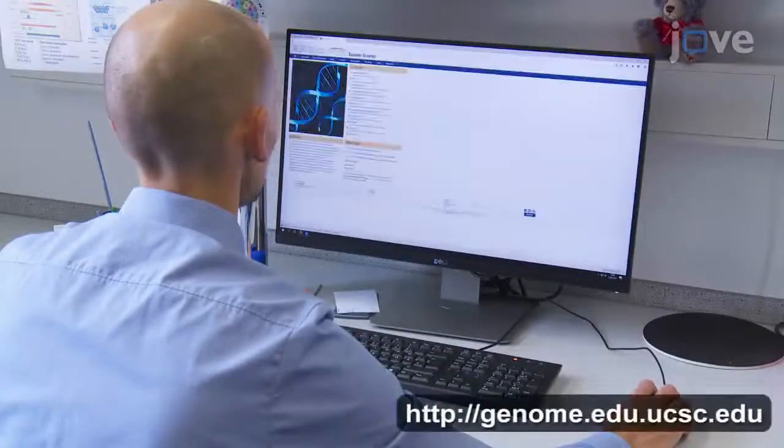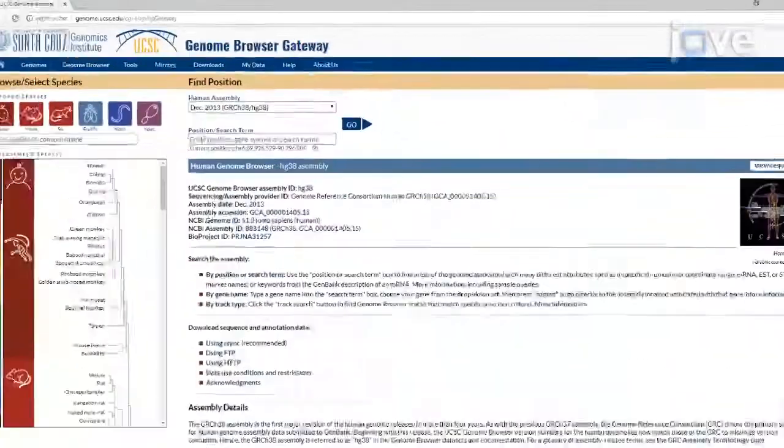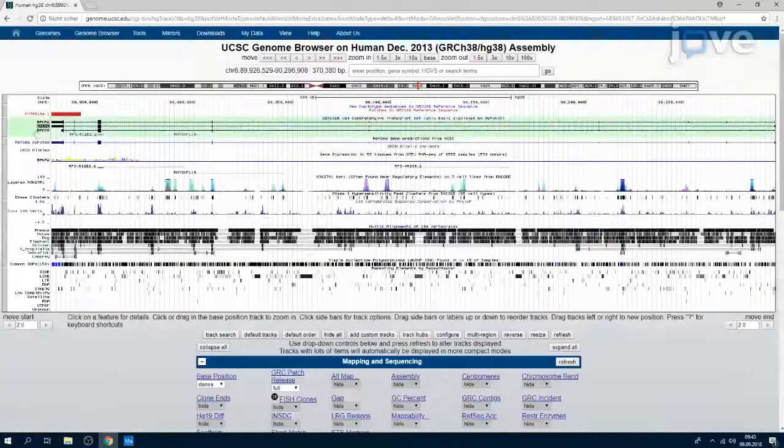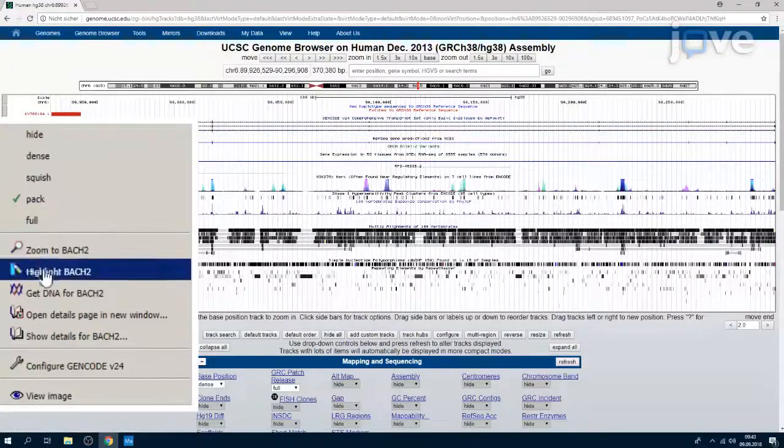Begin by using UCSC Genome Browser to in silico extract the genomic sequence of the desired genomic locus to be targeted.